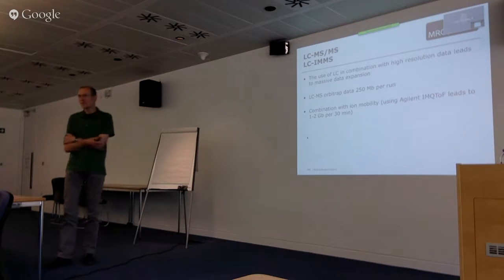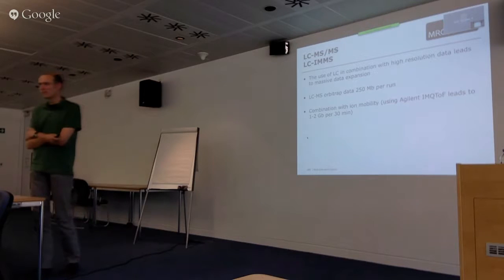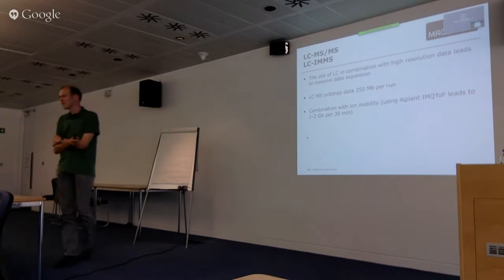Well, I think that with every mass spec, you would say to people, run a sample and then first figure out what it means before you start running the next sample. Then nobody will have this problem.